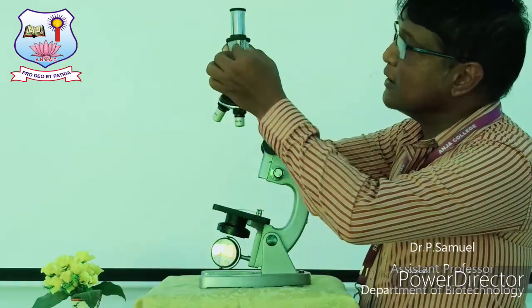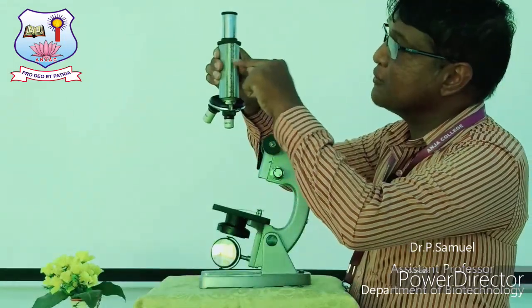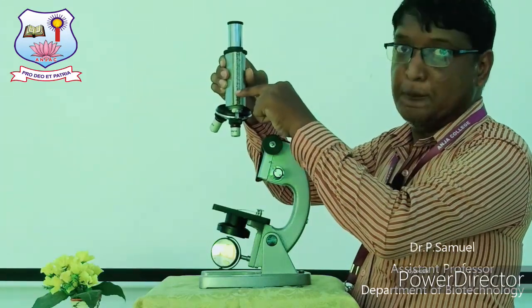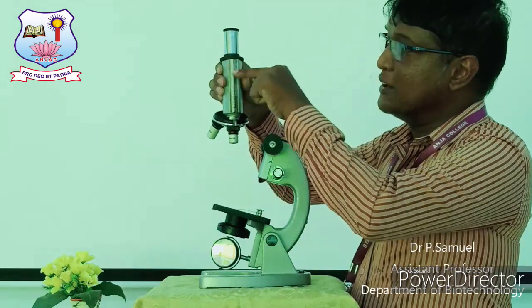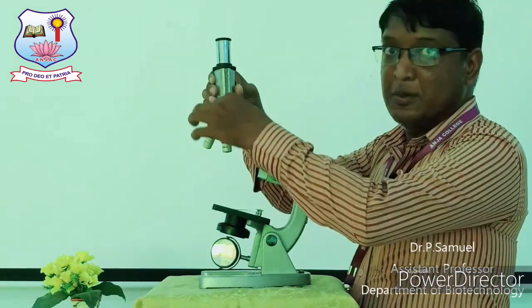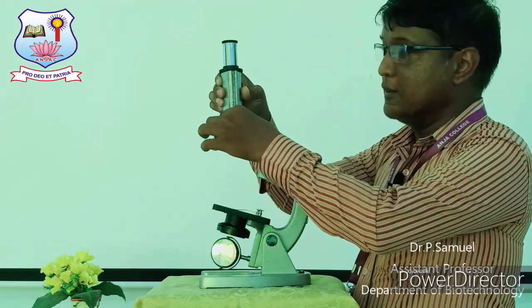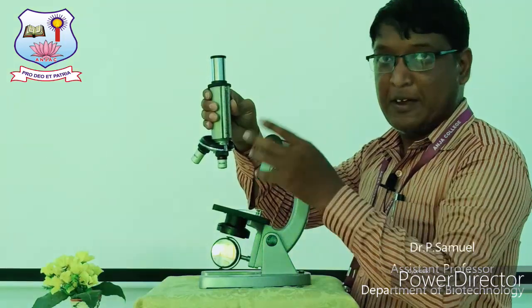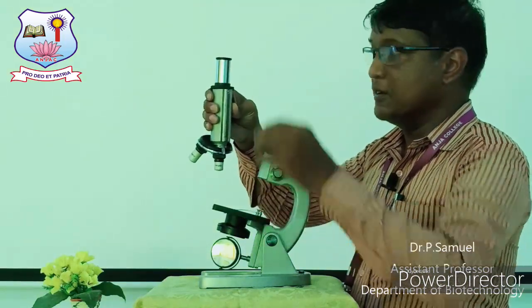And this is the main area. See, you could find the arrangement of the axis. This should not be spoiled. If it is spoiled, the smoothness of the movement of the body tube will be entirely spoiled, right? So use both of your hands to adjust the fine adjustment as well as the coarse adjustment.